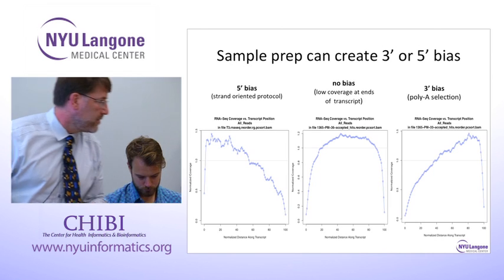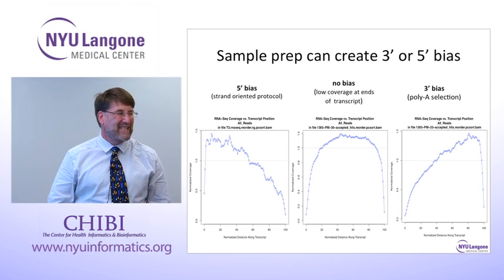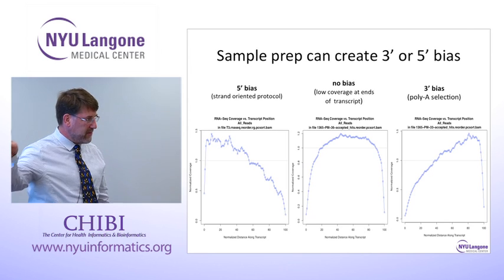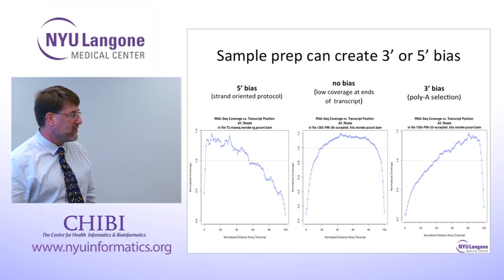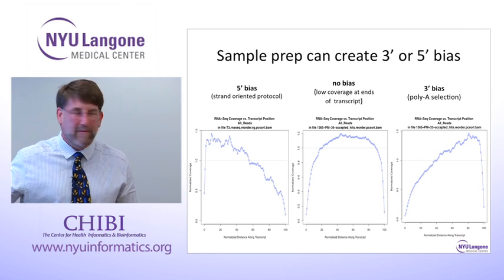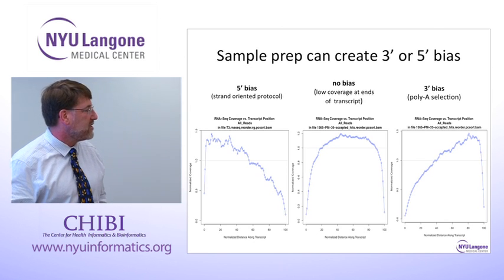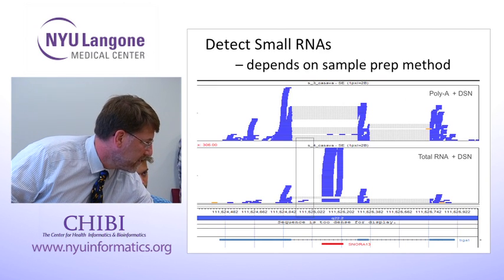Sorry, so the middle one is all just random primes? Yes. I don't know exactly how they did this. This came from an outside collaborator, but I'm saving it because it's extremely beautiful. But clearly, tinkering with your sample prep method is important. And there are numerous different kits available.